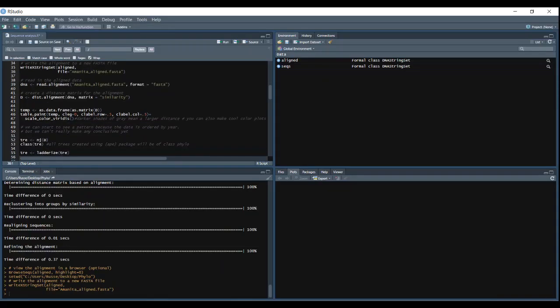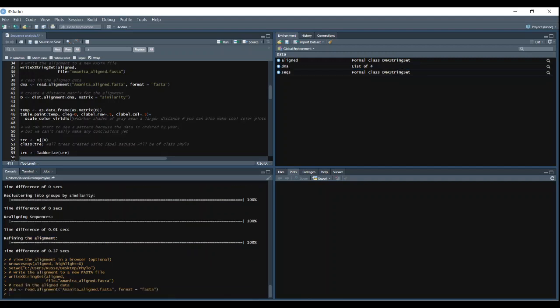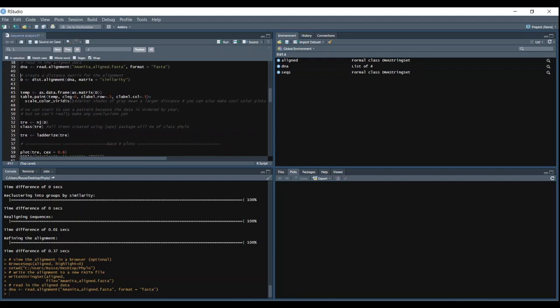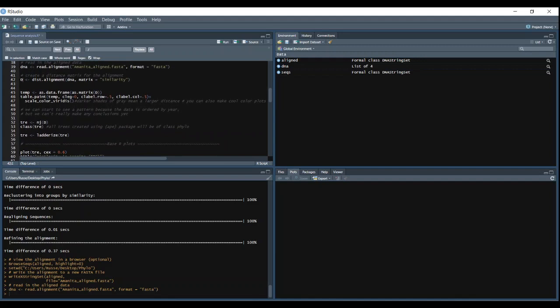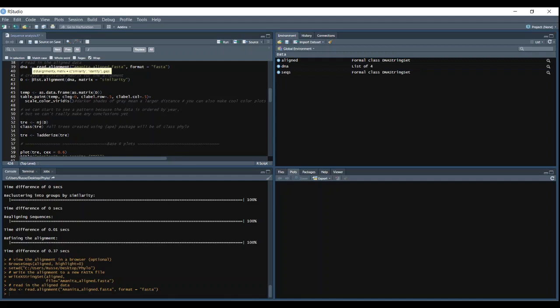Now we can read in the alignment. So we'll use the read alignment function by seqinR. And then read in that FASTA file that we just aligned. And we can now create our distance matrix using distAlignment. If you use this on a file that doesn't have equal lengths, it will crash your R. I found this out the hard way. So just be aware of that. Make sure you align your sequences before you use this function.